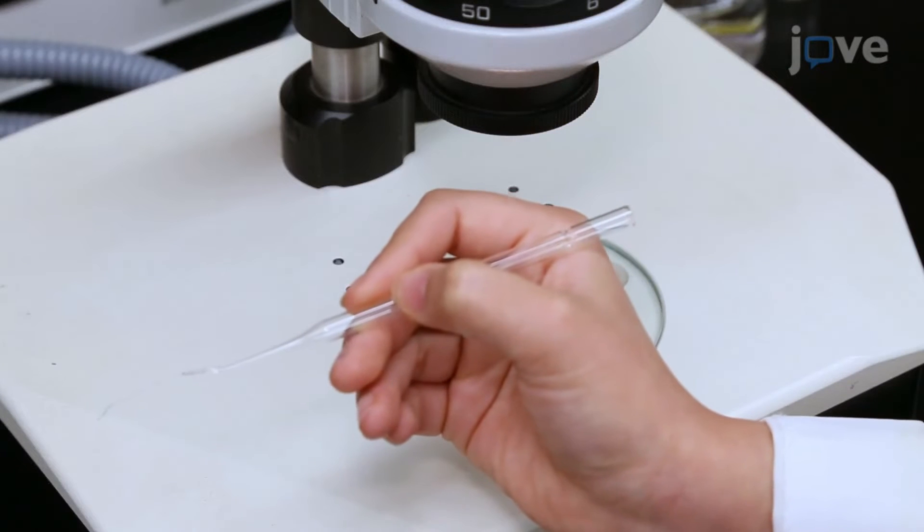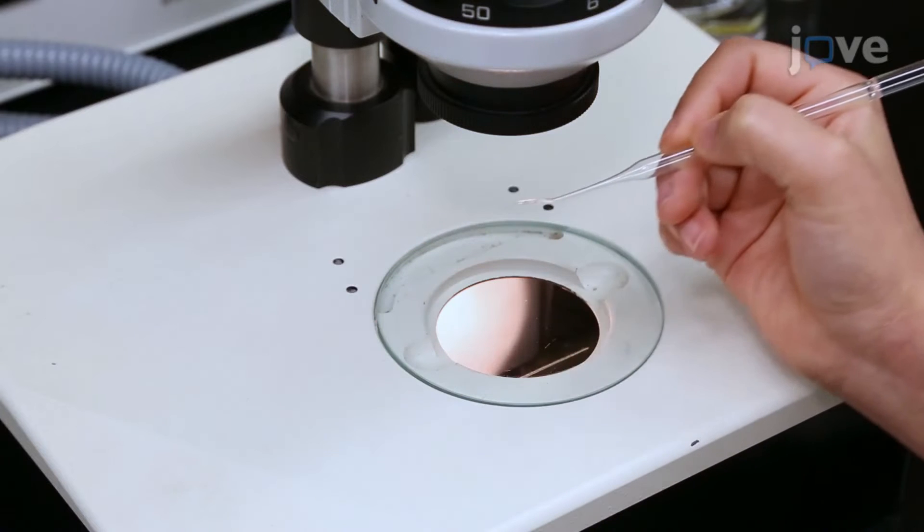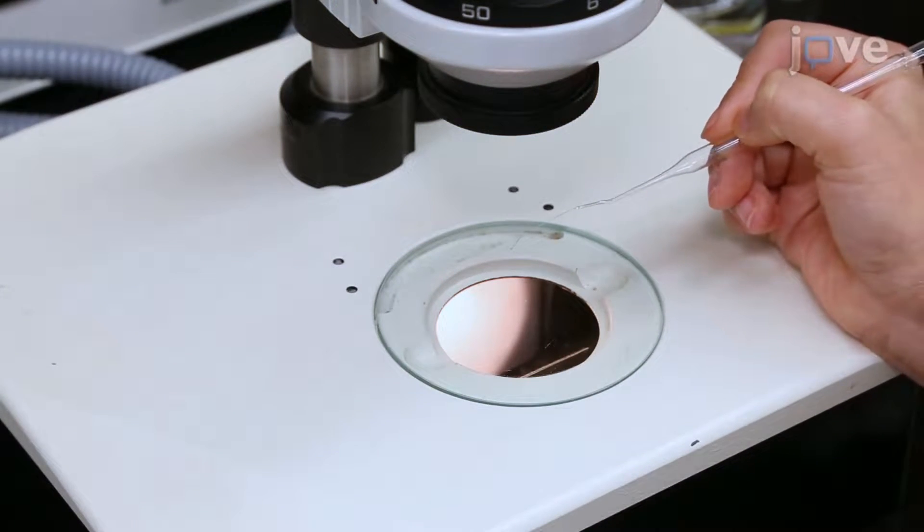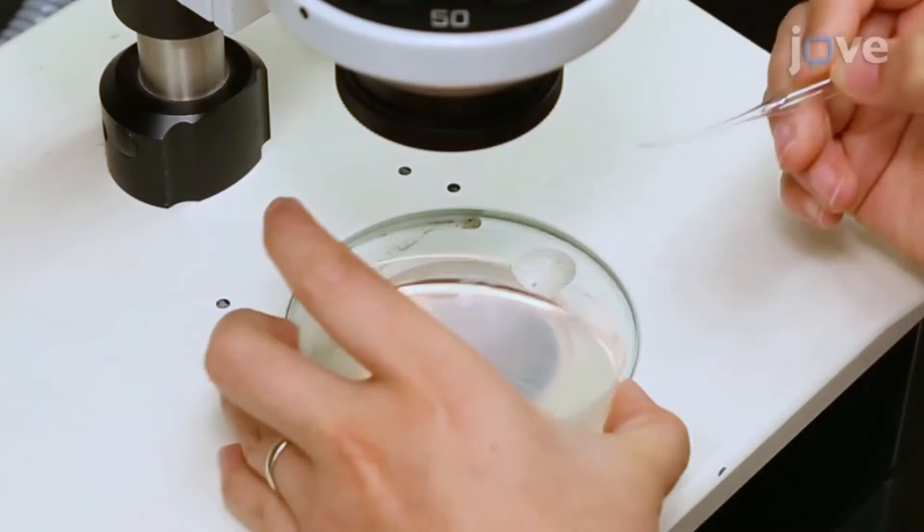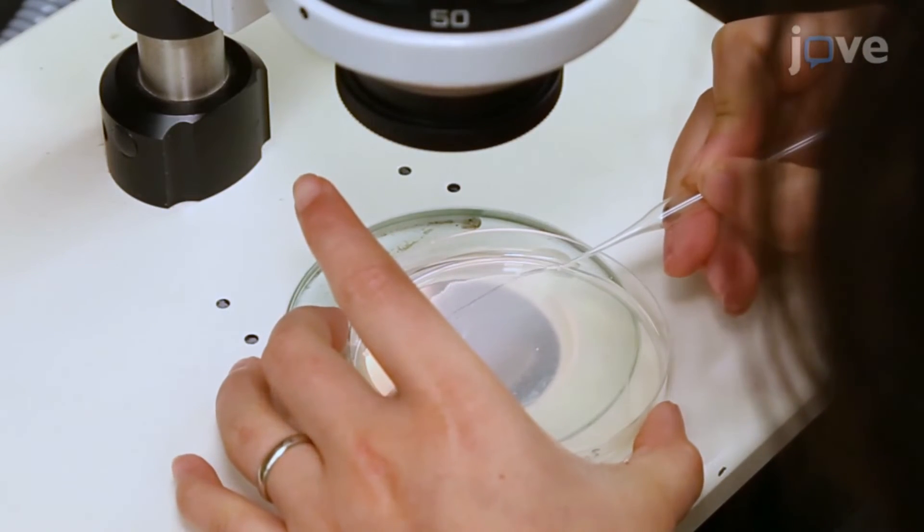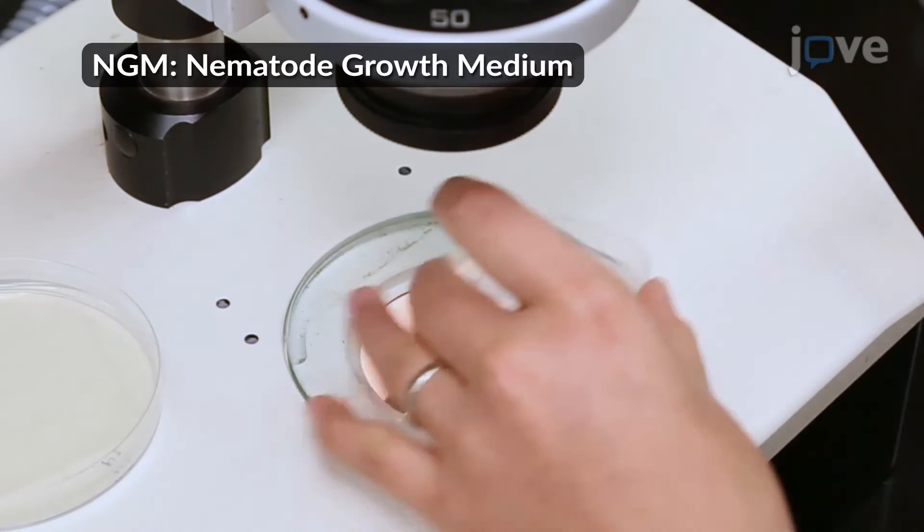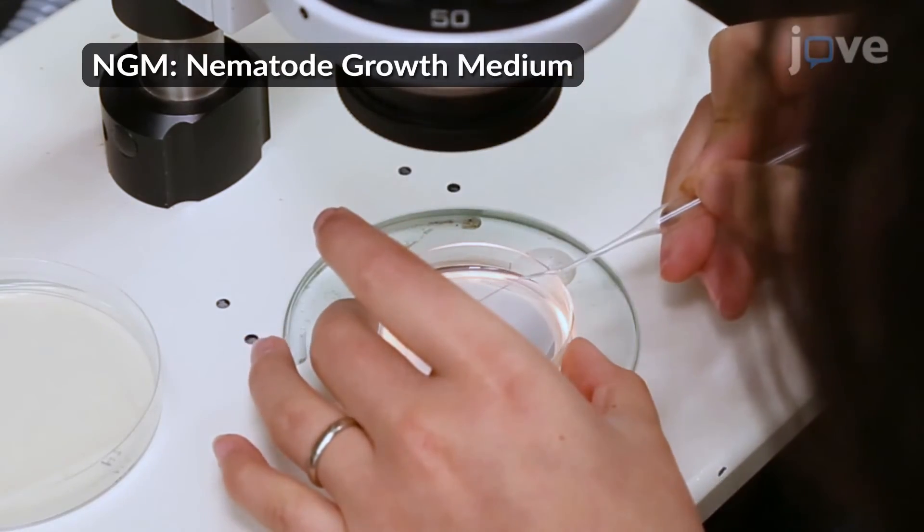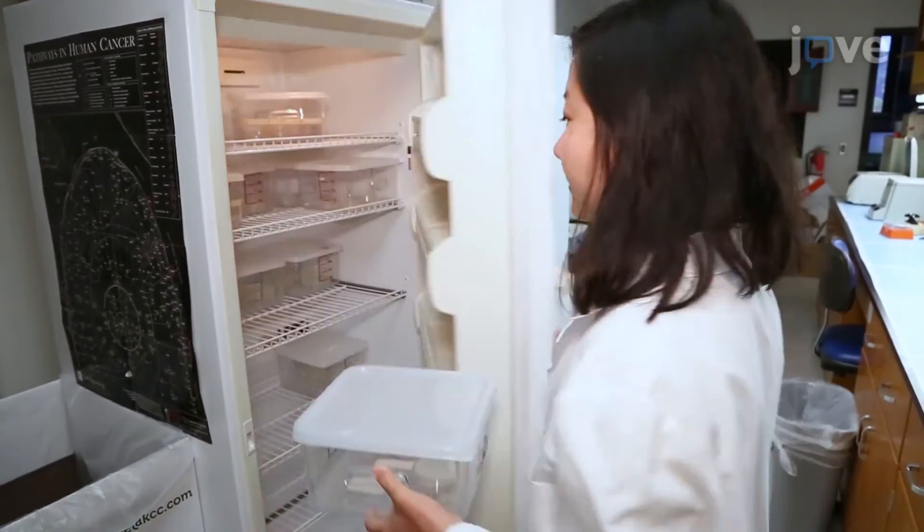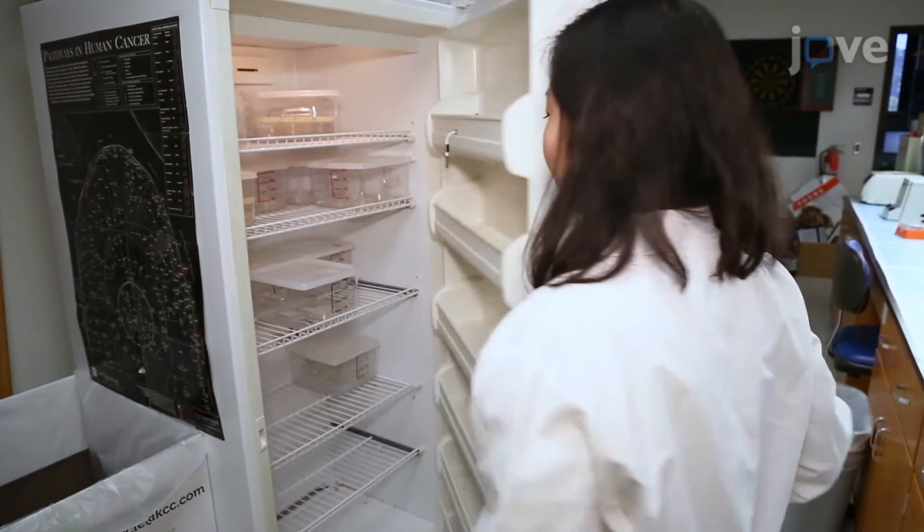To begin, use a worm pick made from a pasteur pipette and platinum wire flattened on one end to pick 20 to 30 L4 stage hermaphrodites and gently place them onto a 6 cm seeded NGM plate. Incubate the hermaphrodites at 20 degrees Celsius for 28 to 30 hours.